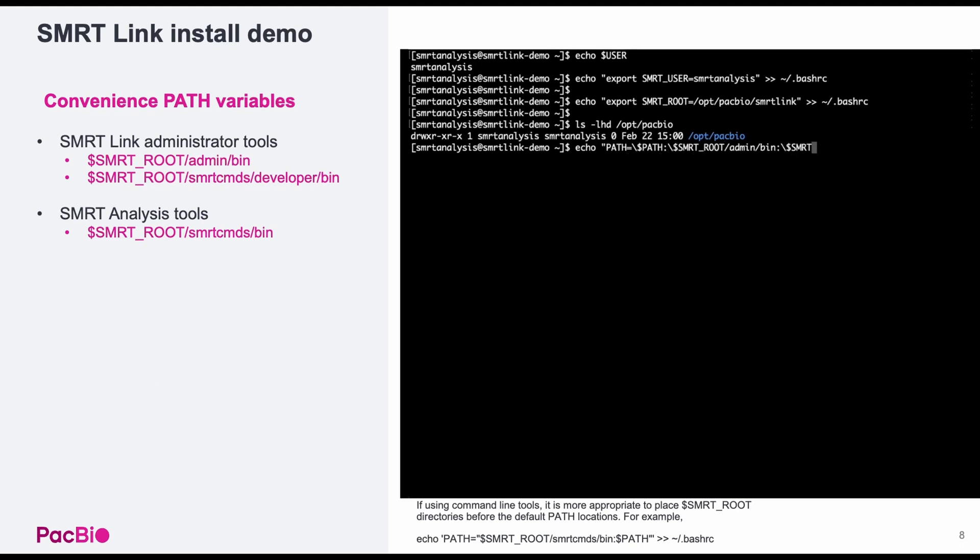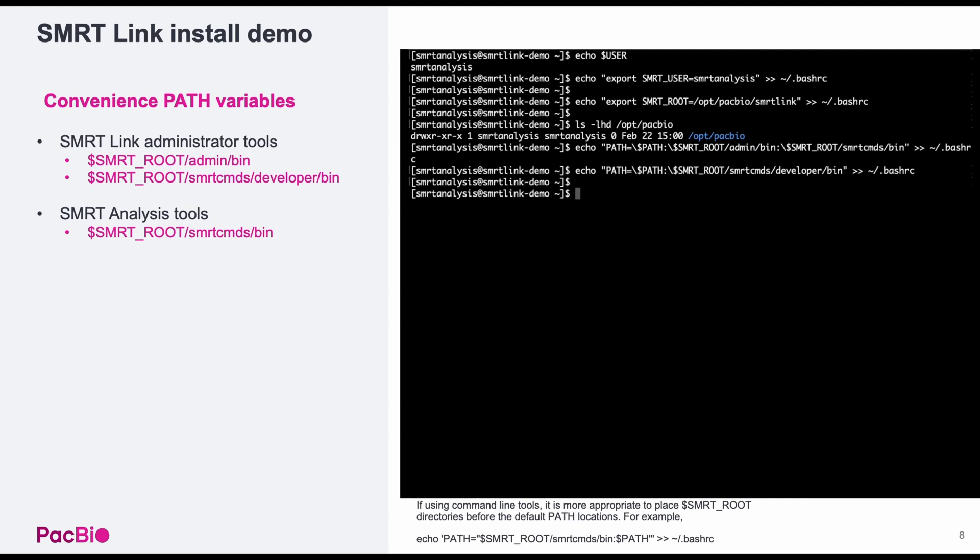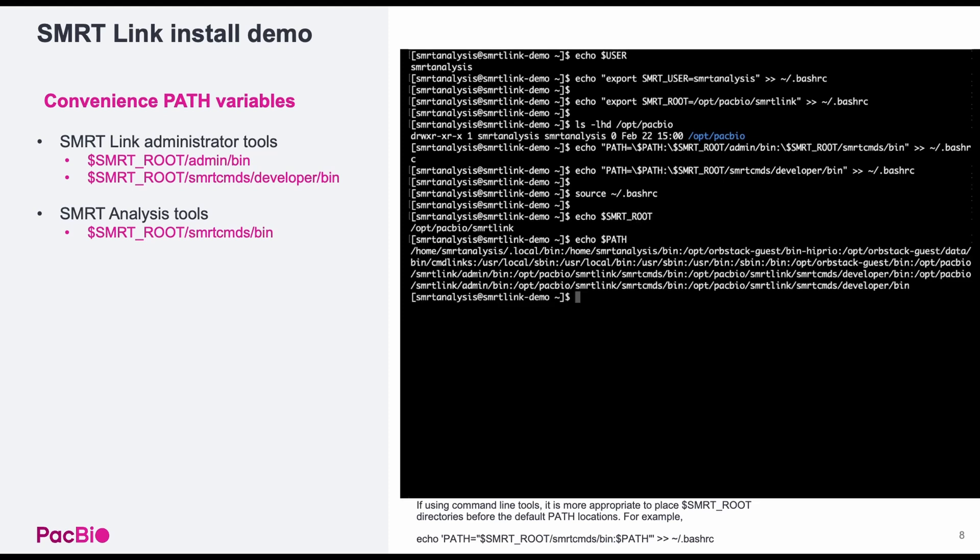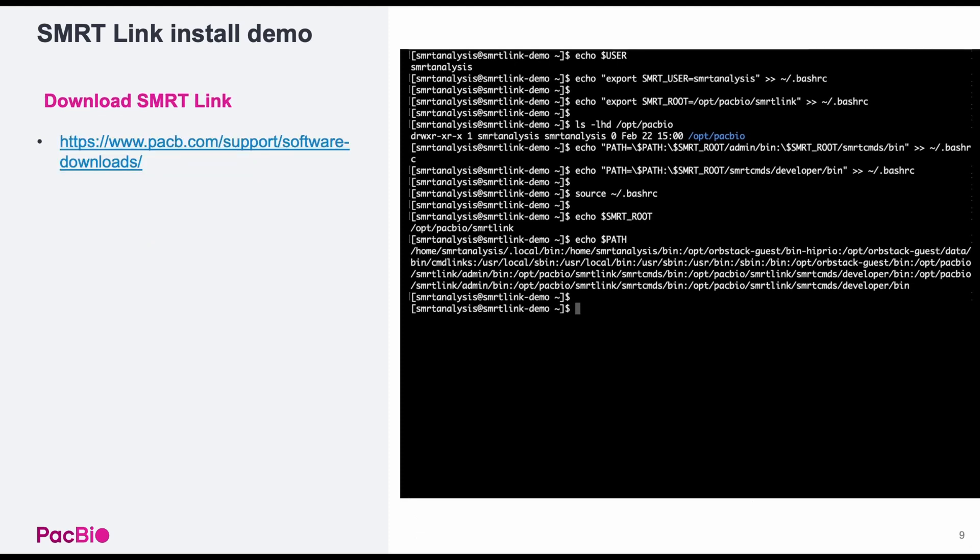There are a few additional directories that will be useful to you post-installation. So for later convenience, let's go ahead and add those now. These include locations to the SmartLink admin and other pack-bio tools. We've added all these variables to our bash-rc, so let's source the file so that they become available to us. And then we can echo smartroot and our path to confirm these changes.